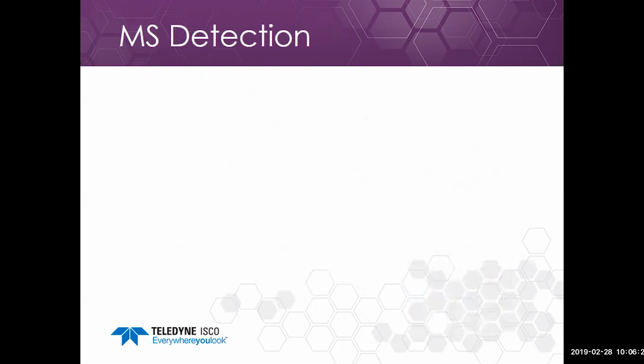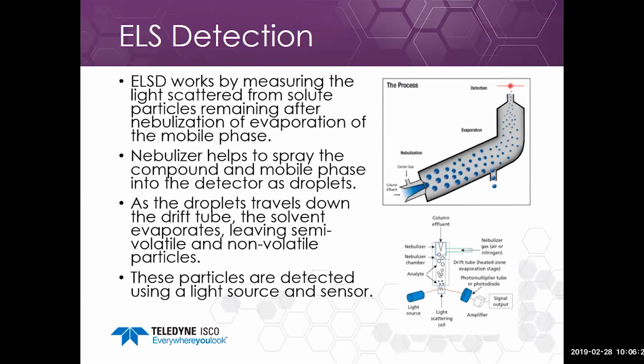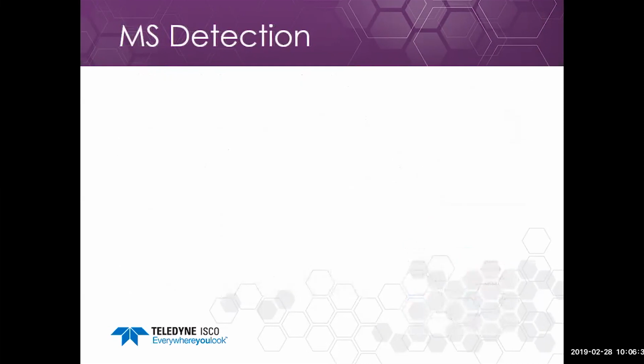It's a great technique for semi-volatile and non-volatile particles. As we're evaporating solvent, if you have volatile compounds, they would also evaporate, and then you wouldn't be able to detect them. So that would be the one downside with ELSD.